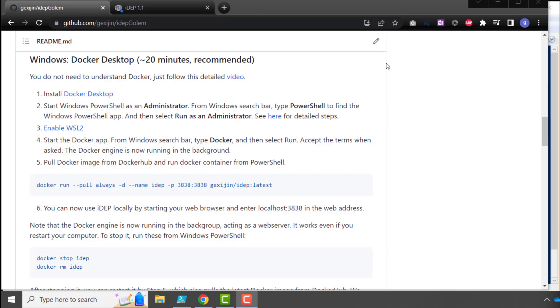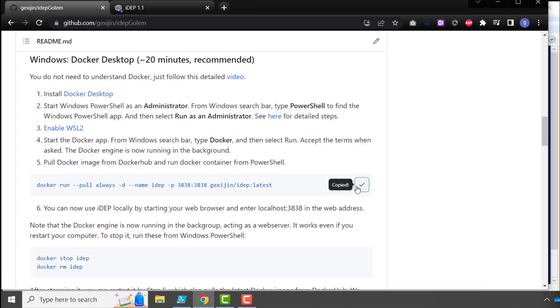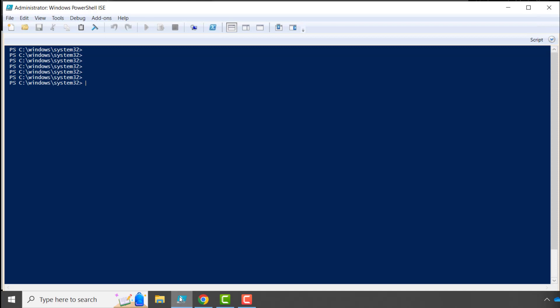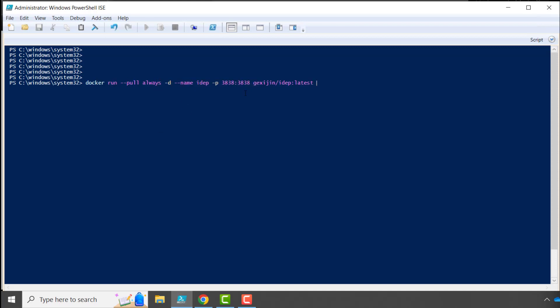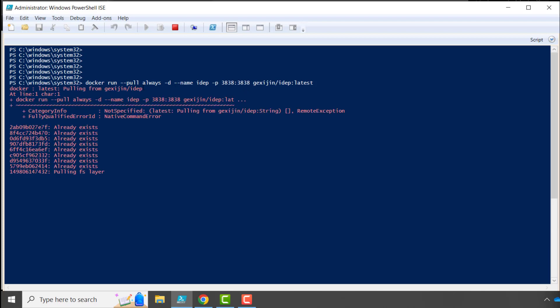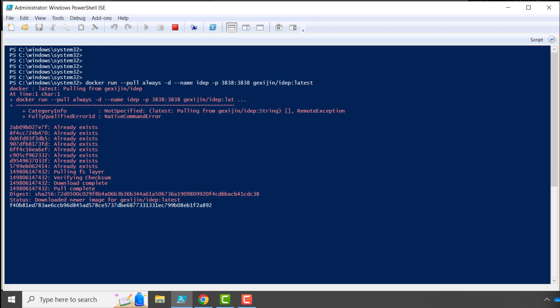Now we are ready to pull the Docker image from Docker Hub, and then start a Docker container. So we come here, and copy this one line of code, and come to the PowerShell, paste this command, and hit enter. So this will do two things. Firstly, the image is pulled, is downloaded from Docker Hub, and secondly, using this image, a container is started.